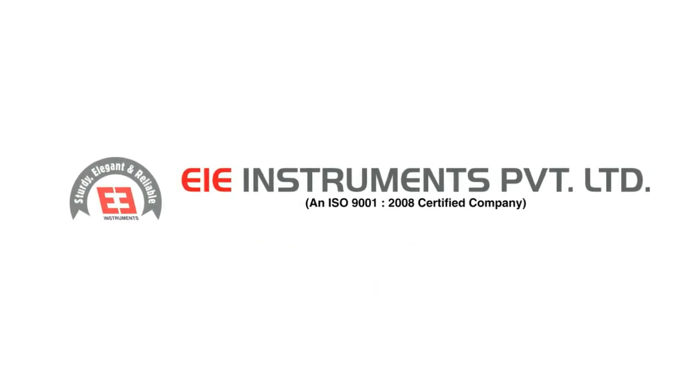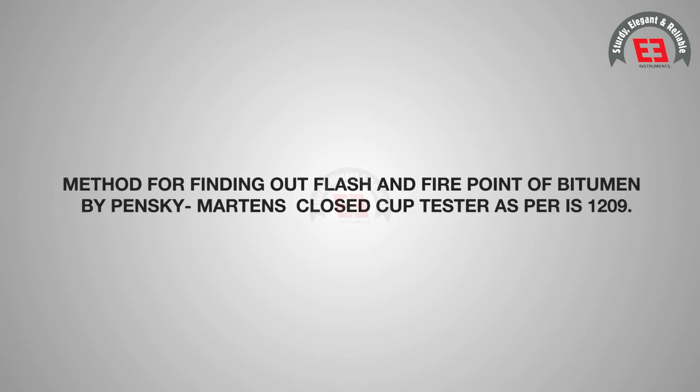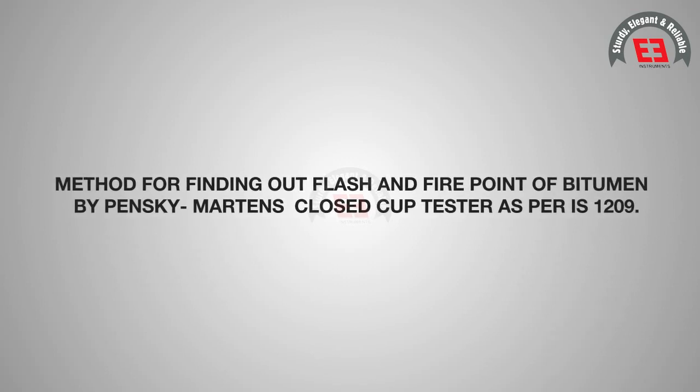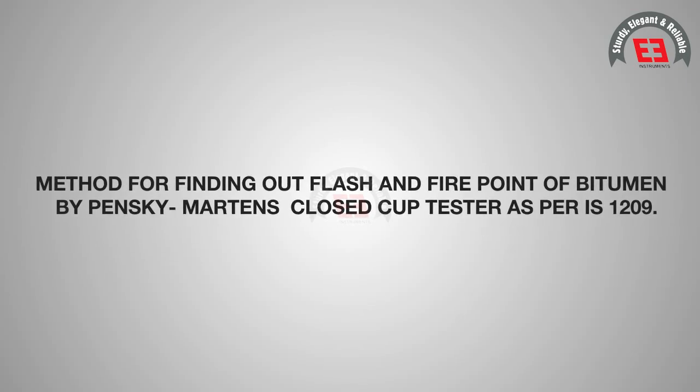EIE Instruments Private Limited presents a method for finding out flash and fire point of bitumen by Penske Martin's Close Cup Tester as per IS 1209.